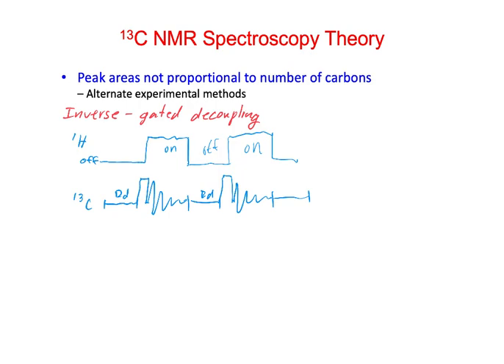So what do we think? How would this influence what we see in the spectrum? Well, you're just acquiring from the C13s? Yeah, the C13 is where the acquisition is, right? So we're not ever actually acquiring signal from the proton. Yeah. So, two things. One, what about decoupling?